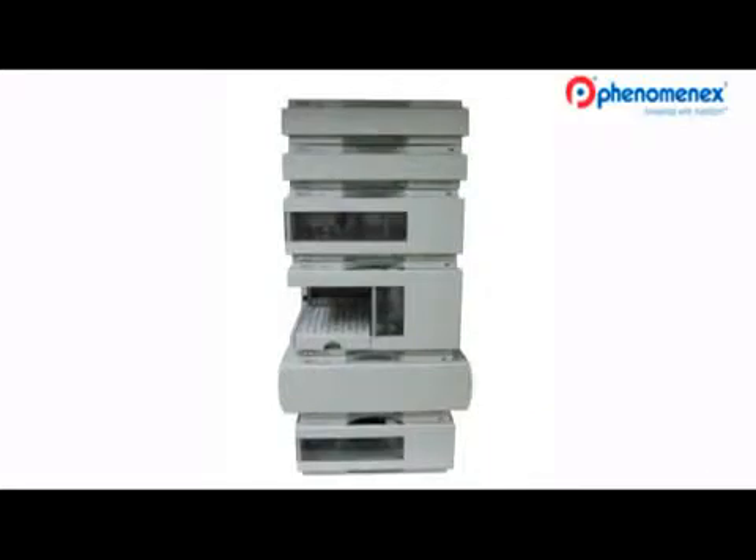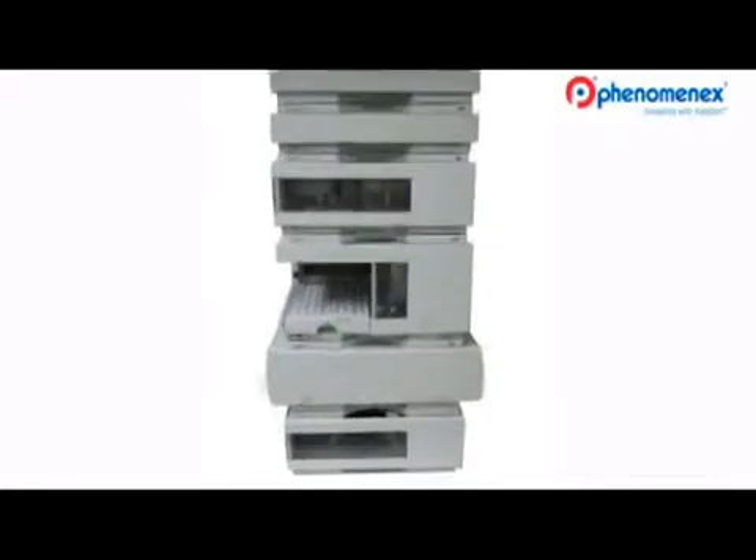Hello, I'm Dr. Ismail Rustomov, group leader here at PhenomenX. The most relevant system parameters affecting peak volumes are the following: the connective tubing volume, detector response time, and dwell volume. With Dr. Rustomov's supervision, I'll now demonstrate the optimization steps for you.